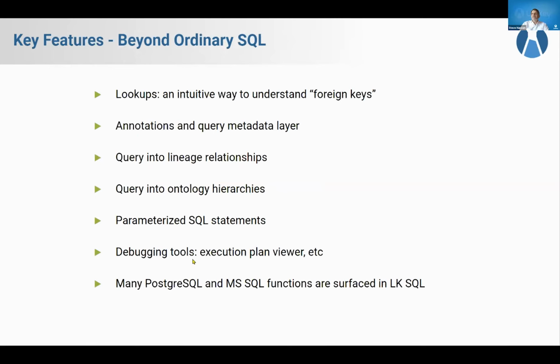And there's really more than I can say about LabKey SQL. It goes beyond just an ordinary SQL dialect. There's all kinds of additional layers and value adds to the dialect. First thing that comes to mind is just lookups. Lookups are a way to capture the relational side of databases. They're a way to make one table link to another table and get its values from another table. Just saying the word lookup really already gives you a sense of the intuitive nature of the relationship and how it works. It's a much more intuitive way to understand what's under the covers, which are foreign key relationships, the relationship between a primary key and a foreign key.